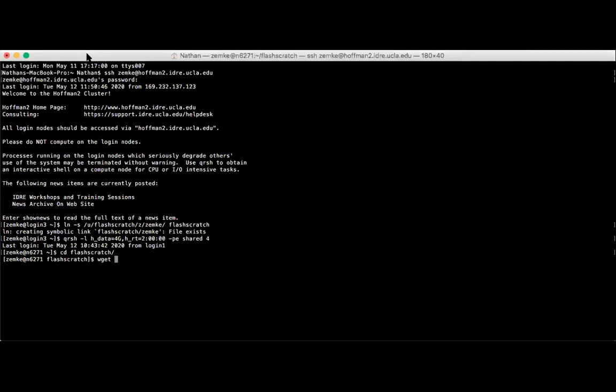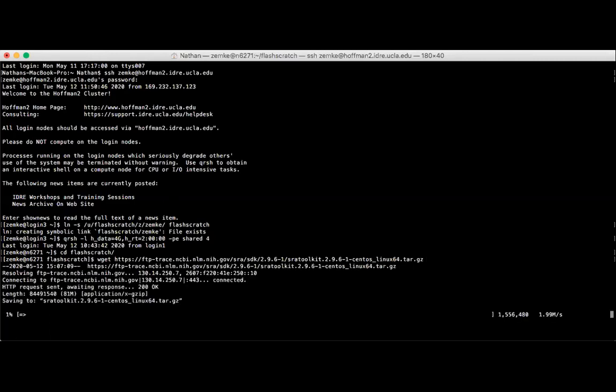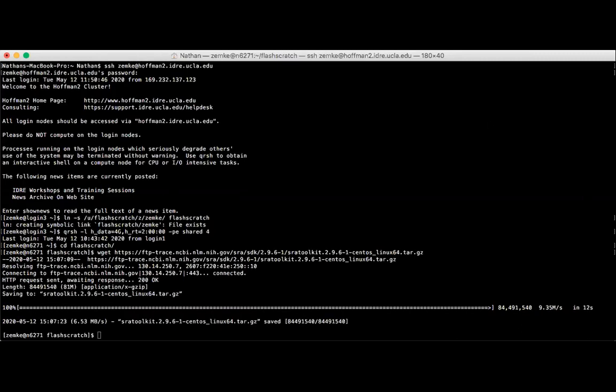But I'm gonna copy this link in, so that should allow me to download this compressed folder with the SRA toolkit.